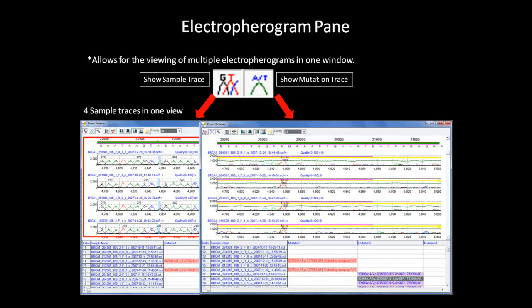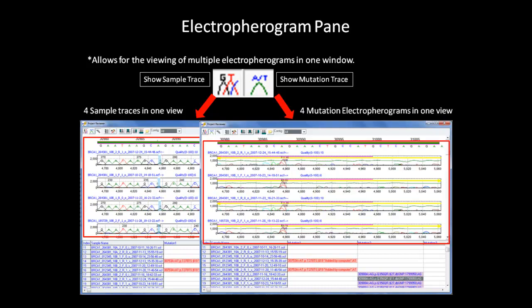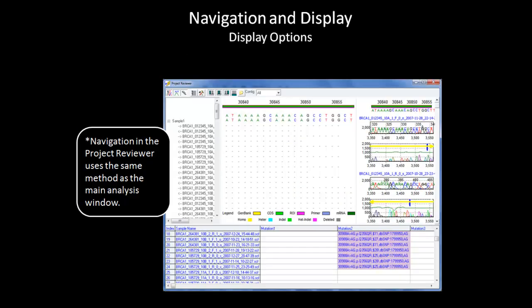The second example only shows the mutation electropherogram for each sample trace. Again, four electropherograms are shown at once. The variation is indicated with a peak at the position of the detected variant. The default display is to show each sample trace along with its respective mutation electropherogram. Just like the main analysis window, the navigation for each pane uses the same zooming and scrolling method as discussed in the introductory webinar. Another similarity to the main analysis window is that the display for each pane can be chosen by you.